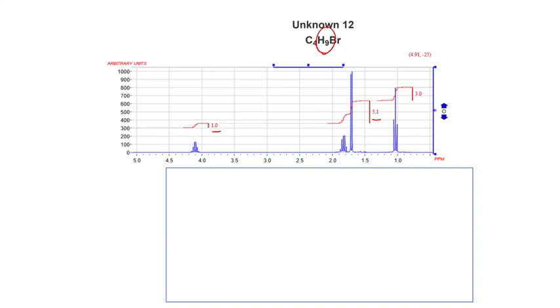Next, look at this integration, and this happens sometimes. 1, that sounds good. 3, that sounds good. What the heck is 5? All right, so what we have to do is use our own judgment as to what these 2 groups are. They are really 2 groups, they just didn't get split by the integration algorithm. So we have to do this ourselves.